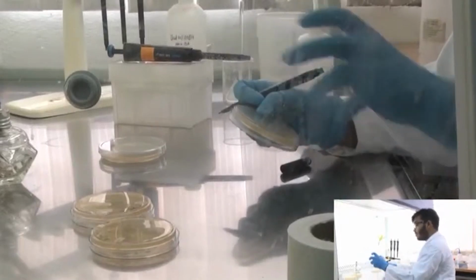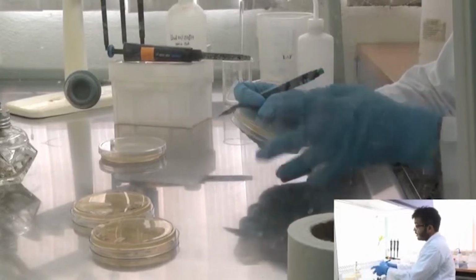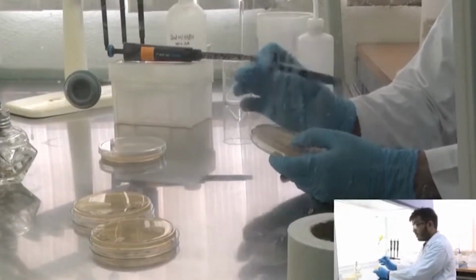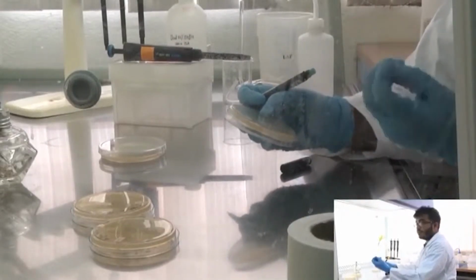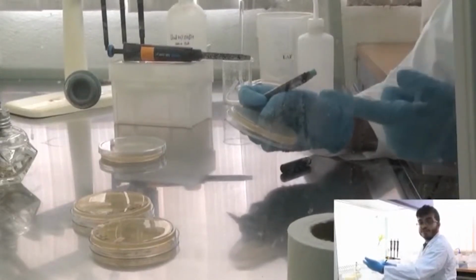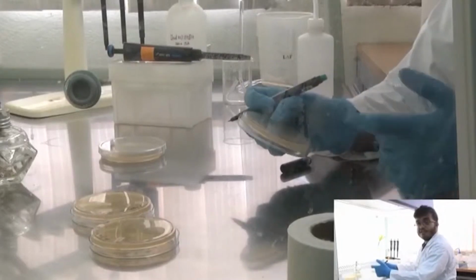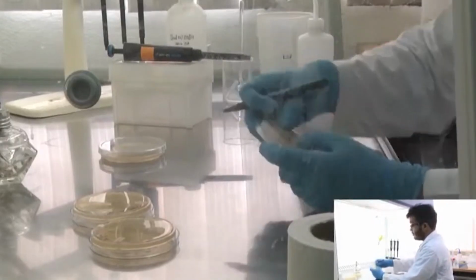But those cells which did not take up the DNA are not going to survive on the plate containing that particular antibiotic, and hence when we get colonies, you can be more or less certain that those are the bacteria which took up the plasmid DNA. Of course, subsequently, from those bacteria we need to make cell stocks and isolate plasmid DNA again and send them for sequencing to finally confirm if our gene of interest is present or not. But getting colonies is a preliminary indication that transformation has occurred, and from there we will move on to the next experiments.